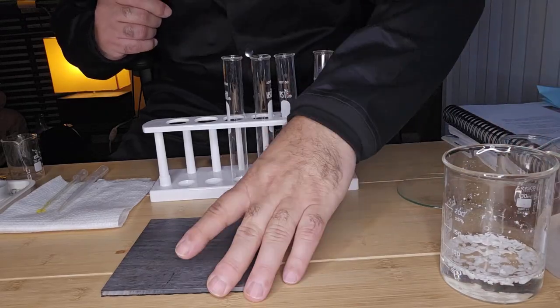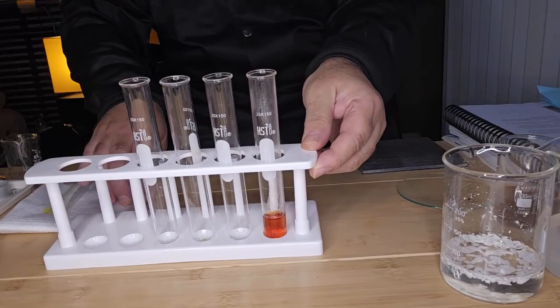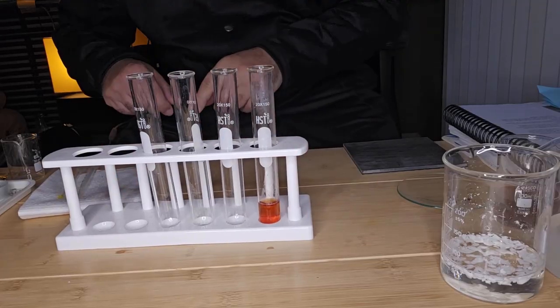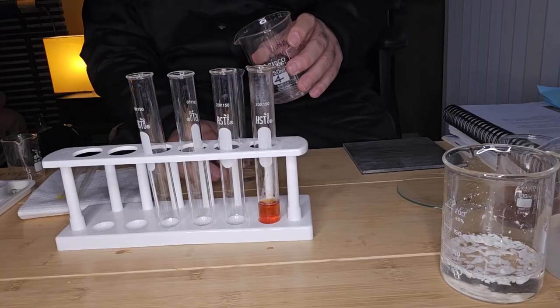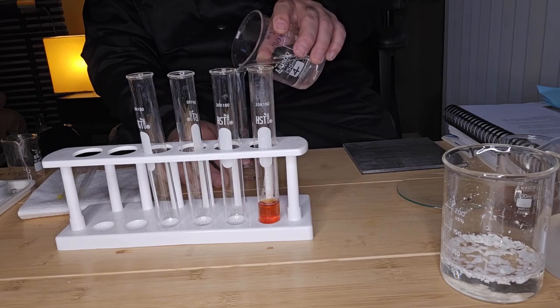The next thing I'm going to do is add, as a control, into my second test tube 5 mLs of sodium chloride. As you know, sodium chloride is a solution. It is not a colloid.